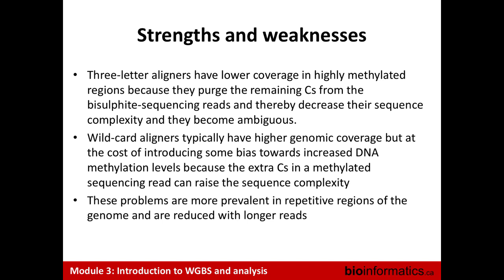There are different approaches, but in the simplest approach you discard the ambiguous reads, because you don't know where to count them. For variant calling, sometimes those reads are used and weighted in different ways, but typically they're discarded just because it's simpler.